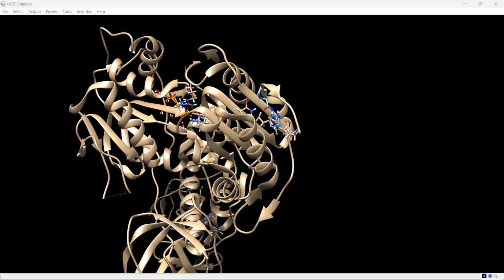So steric only is perfectly acceptable for fragments or small molecules. Okay, and we're going to consider each model in isolation from all others. So okay, it's now added the hydrogens to our molecule. Now we're going to do the same with the charges. So okay, and it's given it a protonation state of +1, and this is fine. So this is again the ammonium that's being protonated.